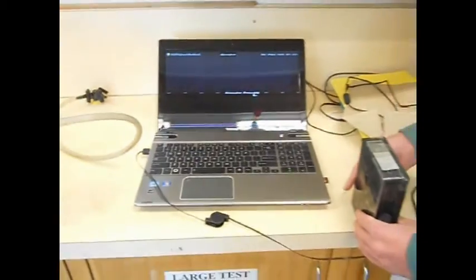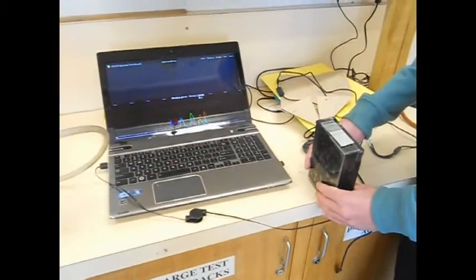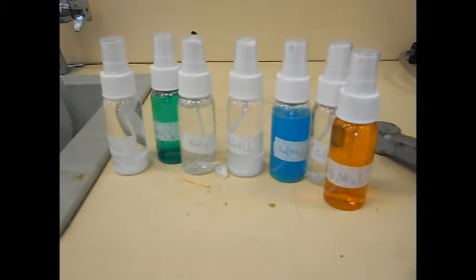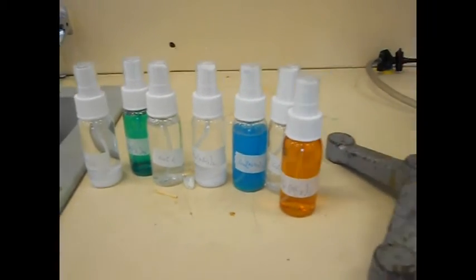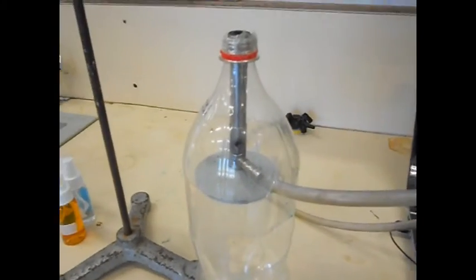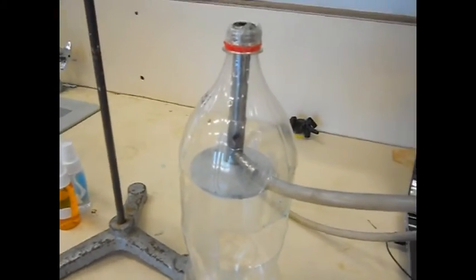Now that we've got those two lines calibrated, we can use the spectroscope to see if we can identify the different solutions that I've made up in spray bottles, which are going to be injected into this Venturi spectroscope flame thrower.